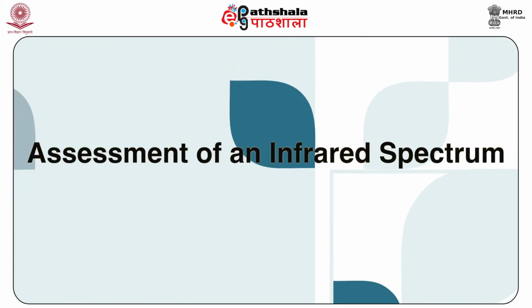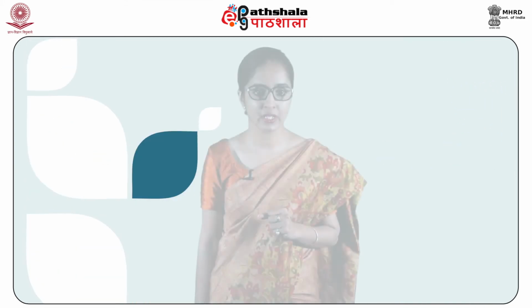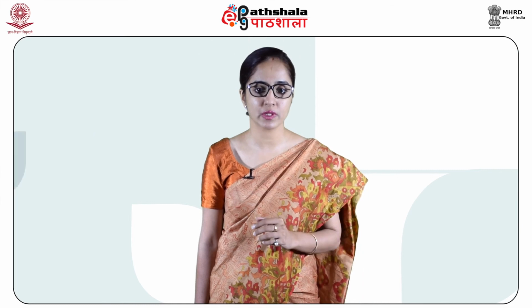Next application, students, is the assessment of an IR spectrum overall. IR spectroscopy is an extremely effective method for determining a variety of functional groups present in a particular molecule. The best way to analyze an IR spectrum is to start looking from the high frequency end of the spectrum, that is typically at 4000 centimeter inverse, and then move towards the lower frequencies. Some of the most common and distinctive absorptions are organized into several regions which I am going to state.